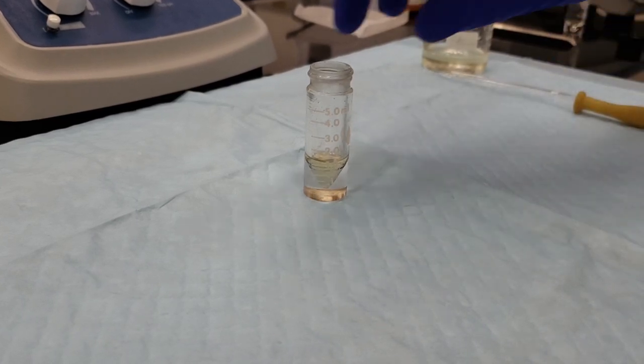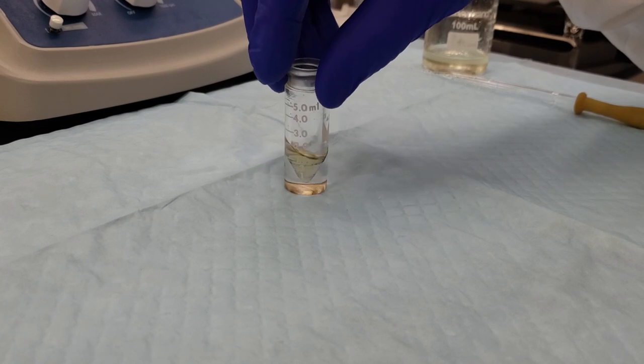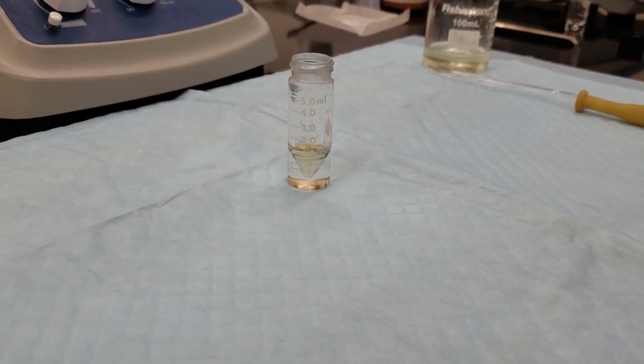I've gotten it all out. I'm going to swirl it one more time just to make absolutely sure so that anything that is aqueous will go to the bottom. I don't see any bubbles, so I think we've got just our pure alkyl halide layer.